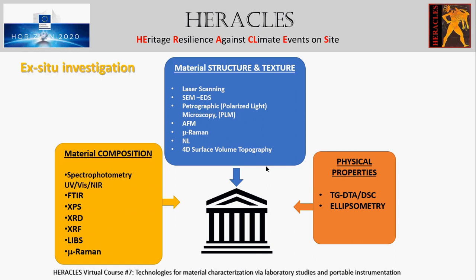LIBS provides analytical information for the determination of minerals, as well as for discrimination of building materials, such as sandstone, limestone, and marble, and for the composition and classification of historic patinas on buildings. Usually, LIBS can be used together with micro-Raman analysis for the detailed characterization of different overlayers present on the monuments, as for example, black crusts from pollution, salts, efflorescences, and so on.